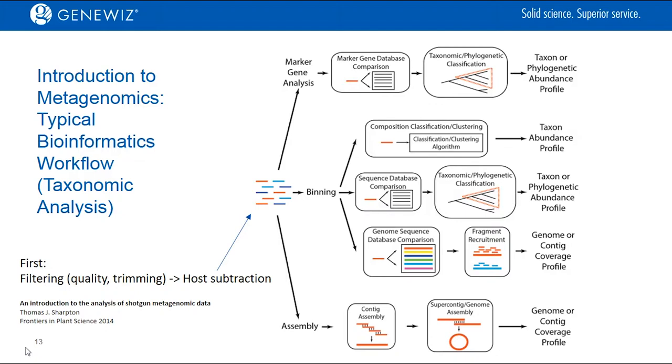The best way, in my opinion, given proper computational resources, is to build a database of all known microbial genomes and to align to that database, returning the best match for each read in the database as its classification. Again, I think indexing your database by k-mer and aligning this way will produce very accurate results very quickly.